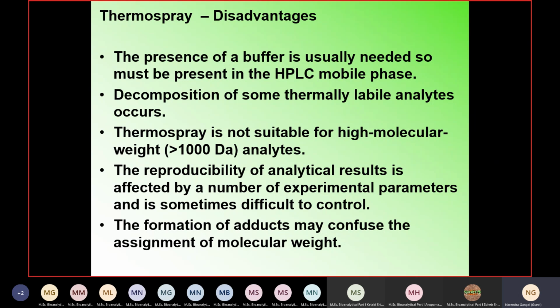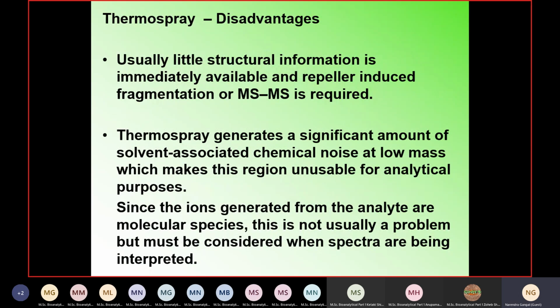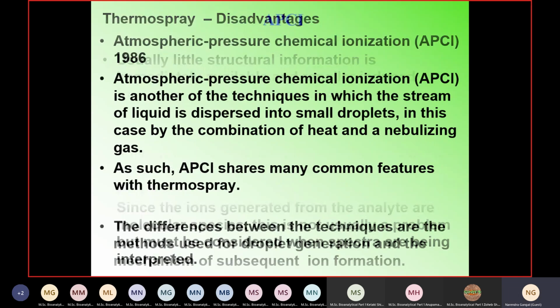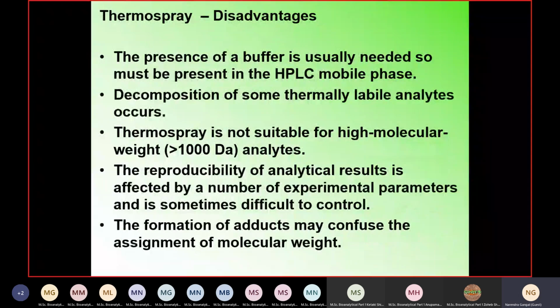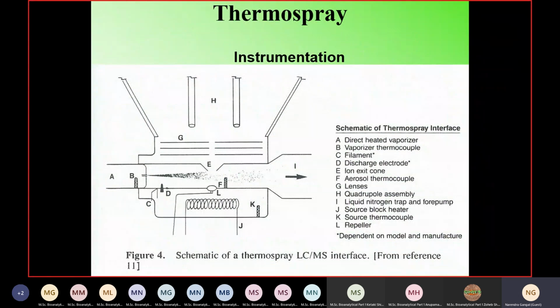So these are some of the disadvantages. We saw the basic theory of thermospray, then the advantages, and then the disadvantages. These are some of the other miscellaneous points. Any questions on this, particularly on how thermospray works? No, sir. So you are all clear?